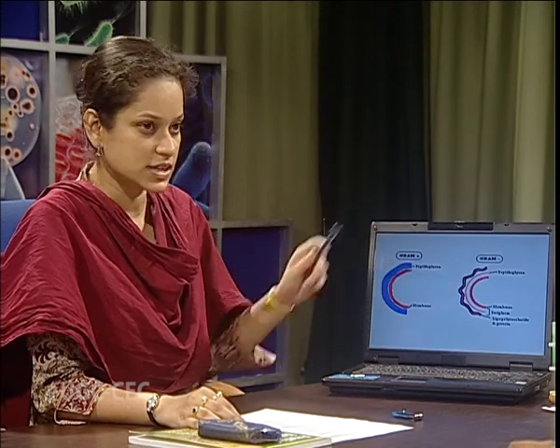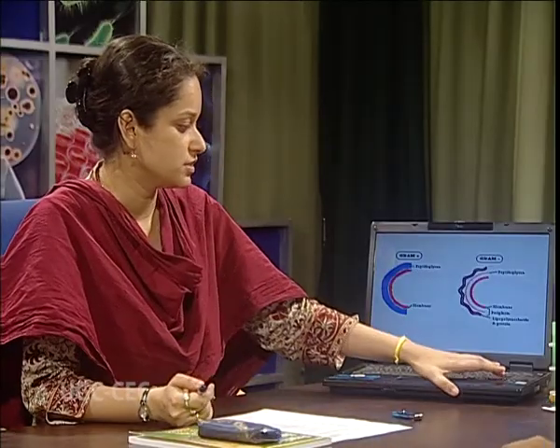In the case of gram-negative bacteria, the outer membrane which is present contains a huge amount of lipids, and we all know that lipids are soluble in alcohol. So, it results in formation of large pores through which the crystal violet iodine complex is lost from the cell wall. This difference in the bacterial cell wall helps in the color development.